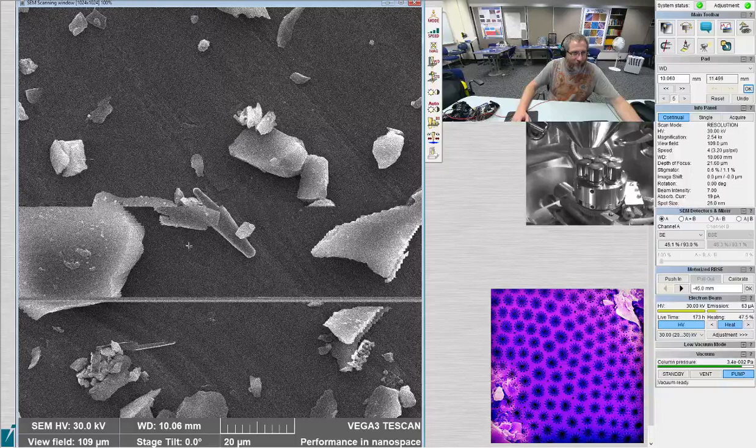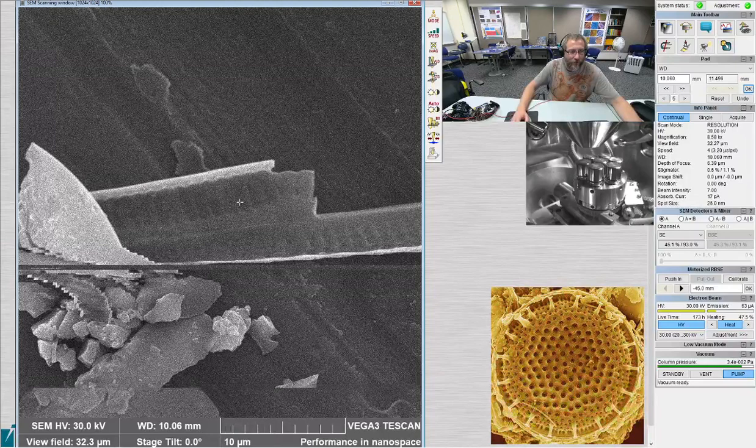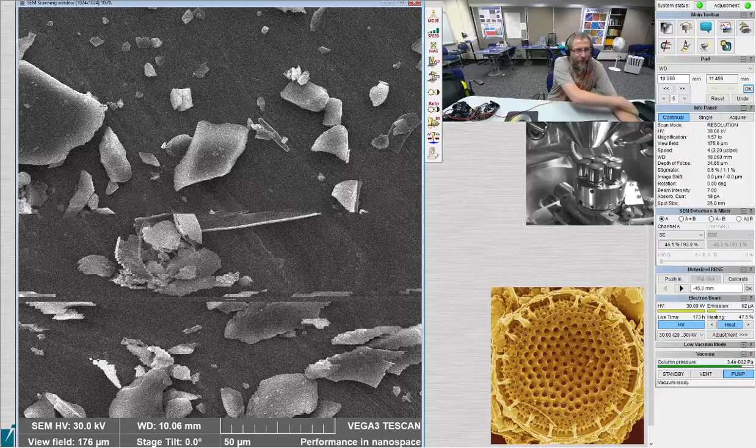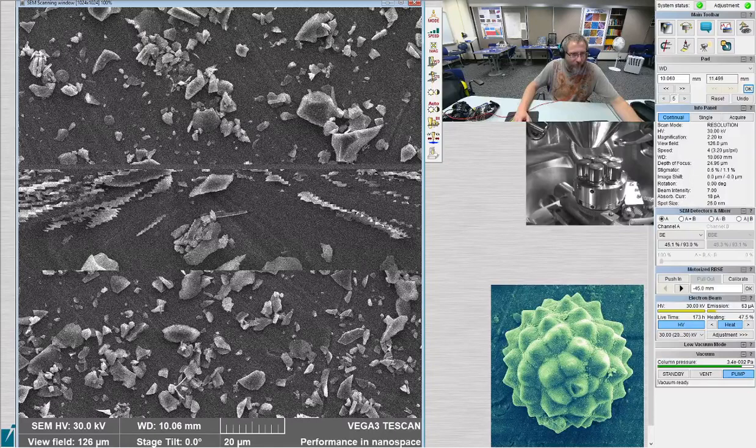On the sample, here's another one that's an internal view. They actually have some really interesting features. We got some pictures on Monday that you don't have yet. Okay, cool. The pore covers are visible in some of them, so you can see they have really weird pore cover around the margin of the pore in some cases. So, great.